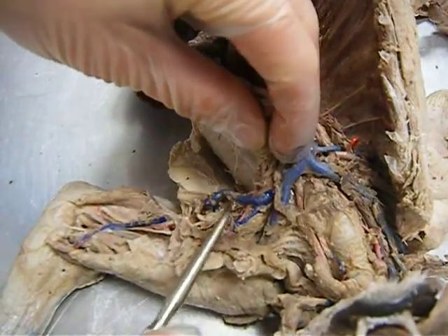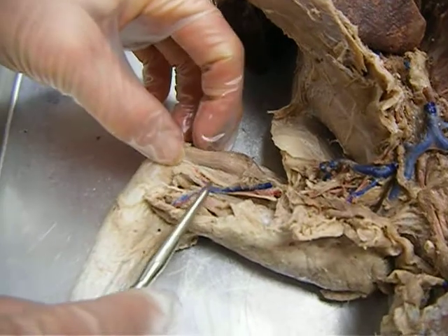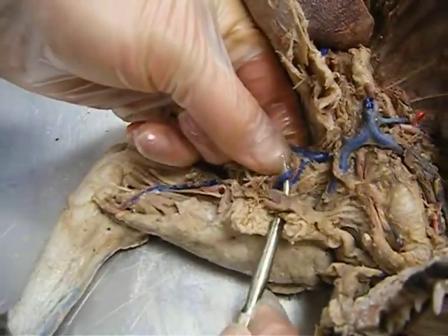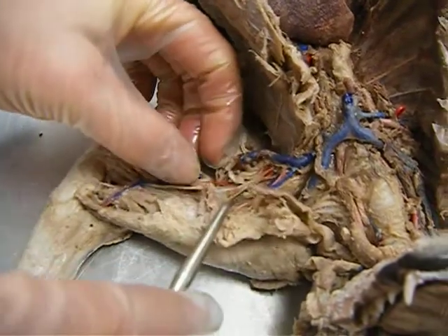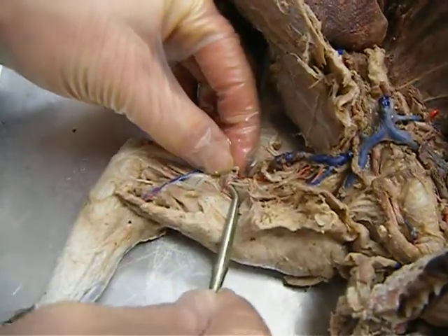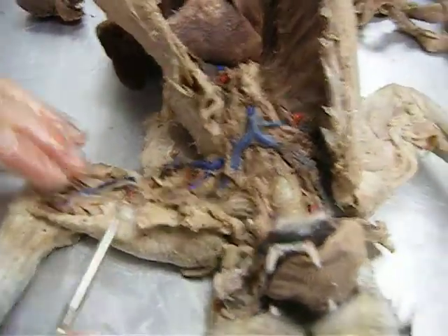Subclavian goes over to the arm where it becomes axillary in the armpit. Then it turns into brachial along the arm, radial, and ulnar. Along the way, the first branch is subscapular to the shoulder, and the second branch is anterior humeral circumflex to the arm. All of them in the arm are arteries and veins combined.